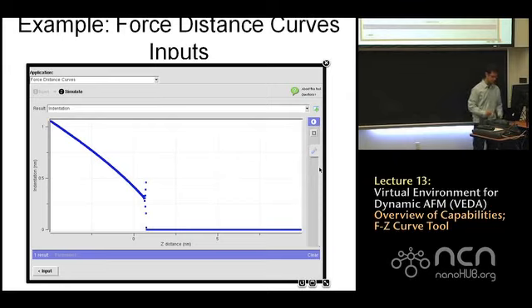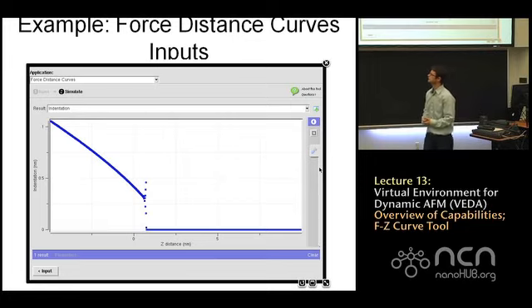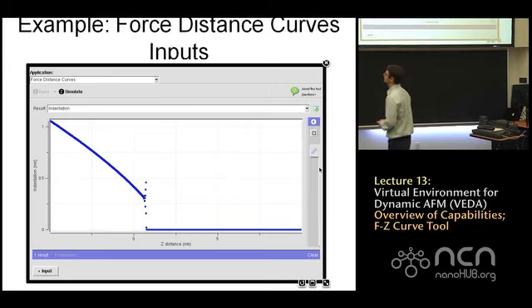And finally, if from the drop-down menu you select indentation, this plots how far the tip has penetrated the surface into the contact forces.